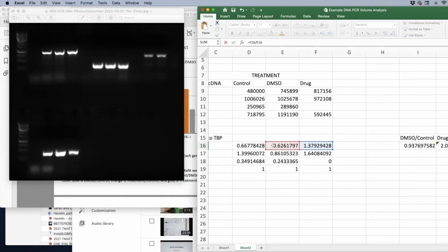Does that make sense? If it's only one gene, it's not the end of the world. You should still have other genes to compare, other genes to report data for. It was all of our genes, so. Oh, none of your control? Redo it, yeah. Oh boy. It was all of them, yeah.